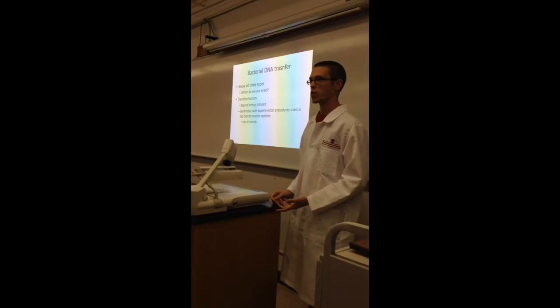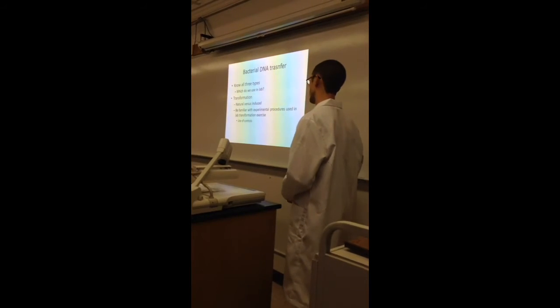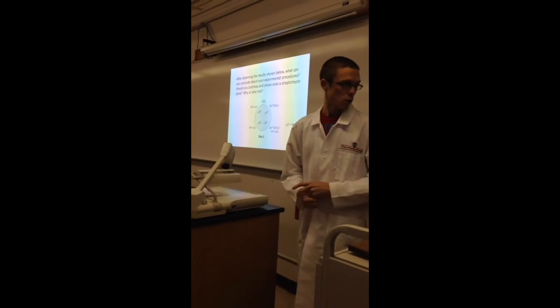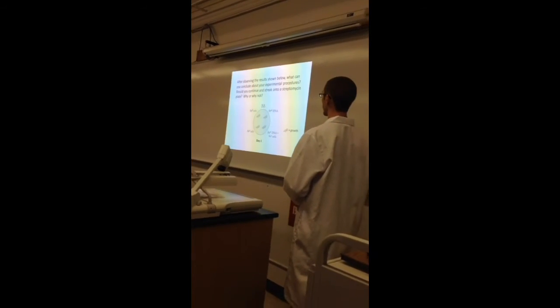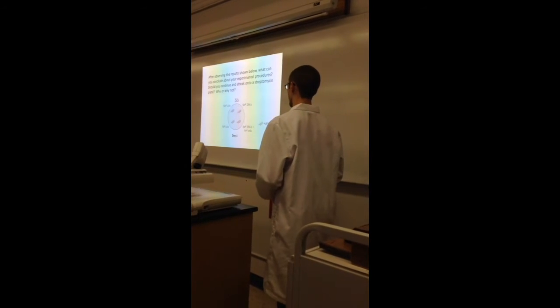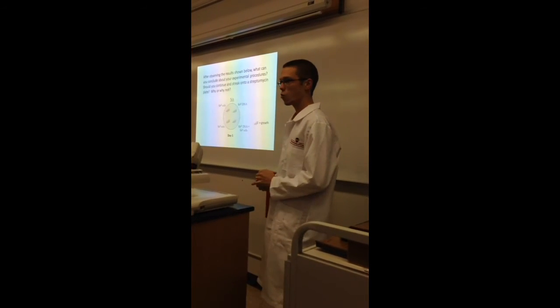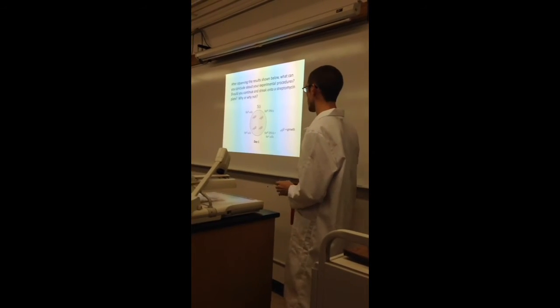I know I've been stressing this a lot, but you can expect to see it a lot, likewise on the test. As just another thought question, you see the results shown below. What can you conclude about your experimental procedures? Should you continue to streak this out onto another streptomycin plate, or should you start over and try again? This is exactly what we saw in class.